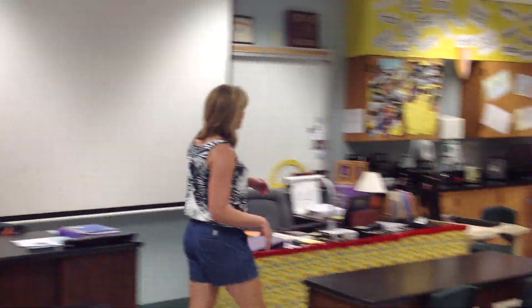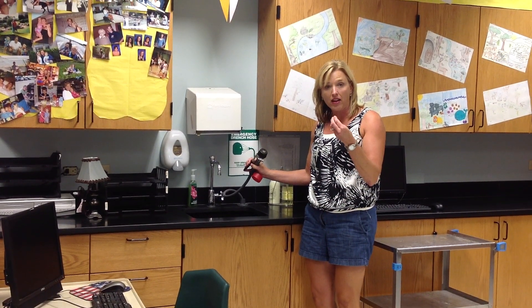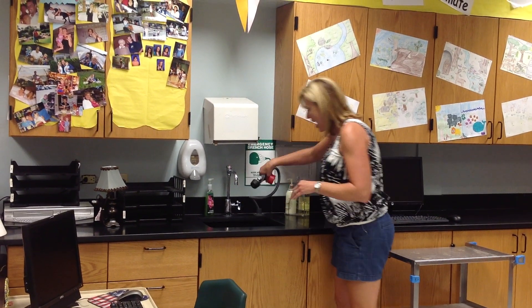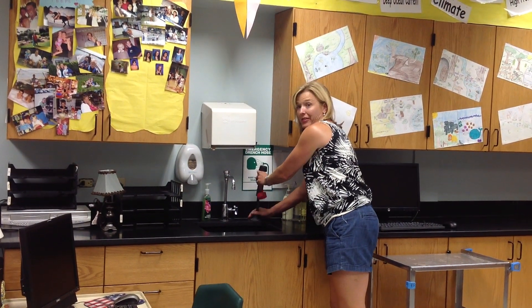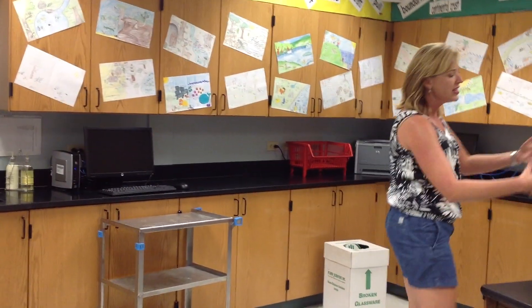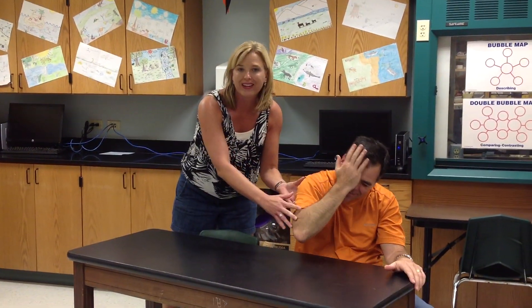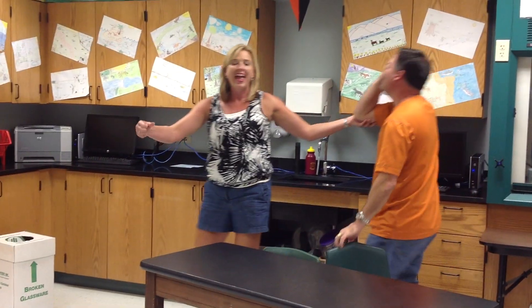On the other side of the room, we have a single eye wash rinse. This is kind of like the rinse in your kitchen sink at home. You don't have to turn on the water, but should you get something in your eye — don't worry about your contacts — you're going to simply place your head over the rinse and sweep. Water will go everywhere, but we want to save your eye. When you have an injury to your eye, you tear up, you close your eyes, you can't see, and it's very painful. So if Mr. Mitchell gets something in his eye during a lab, he's not going to be able to open his eyes to get to the eye wash station, so we'll have to lead him over and actually use it for him.